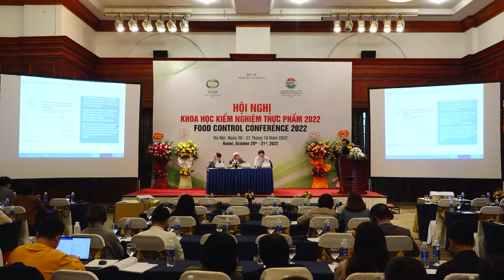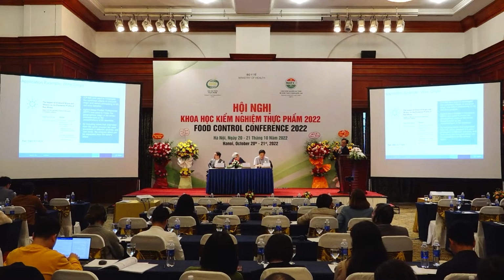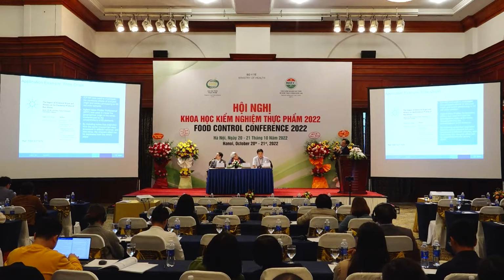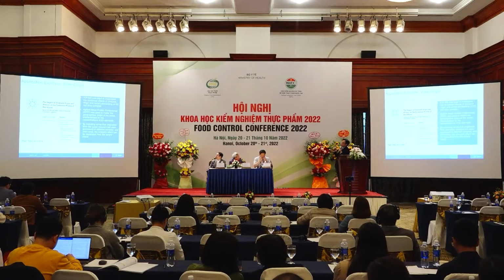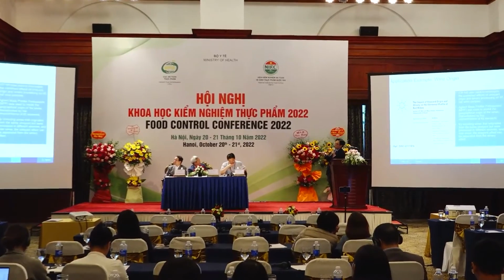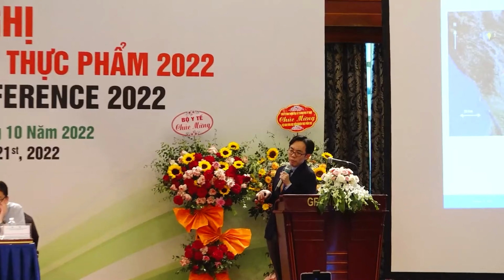You do have to screen through a large number of elements in order to determine which elements are statistically significant. Like I mentioned, we not only look at the vineyards, but we also look at the wineries. The wineries are where the wines are processed, and does that affect the elemental profiling as well? This is the map from where the grapes and the wine were sourced.